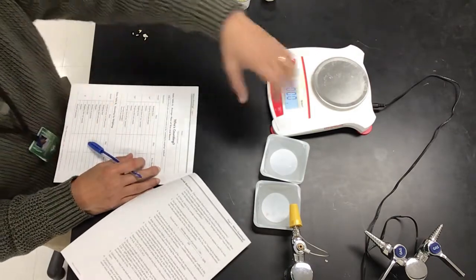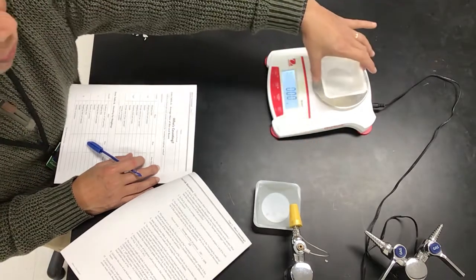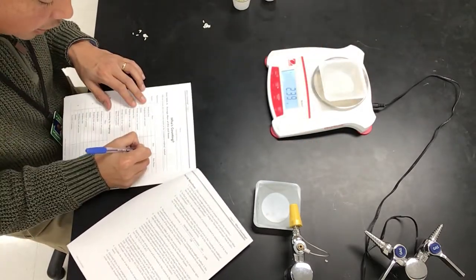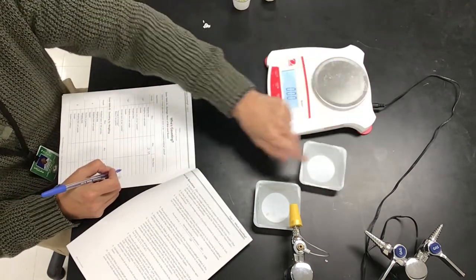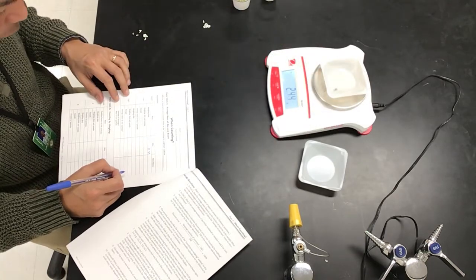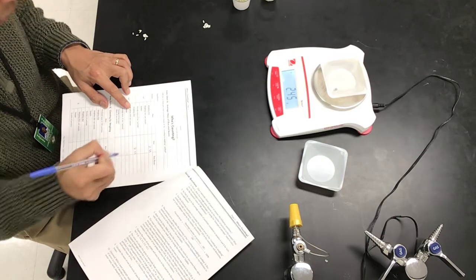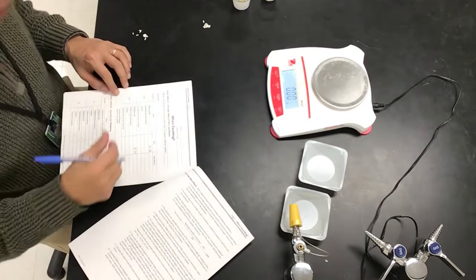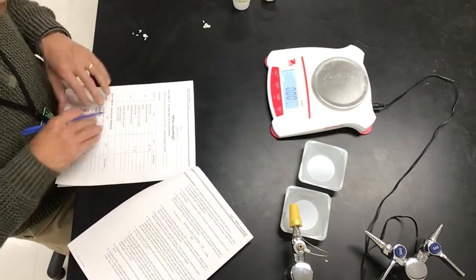So for 10, I make sure I hit zero to zero everything, and put that on there. The mass of the 10 is 2.39, okay? Since I'm already weighing that, I'm going to weigh the mass of the 20 as well. For the 20, it's 2.44, so we're weighing this at 2.44 for the 20, okay? It may change up and down within 0.01 gram, it's all right. Weighing dish and sample, right?